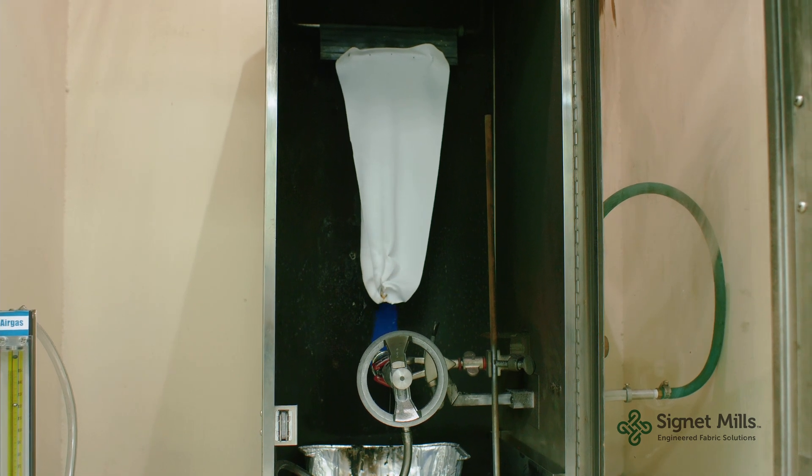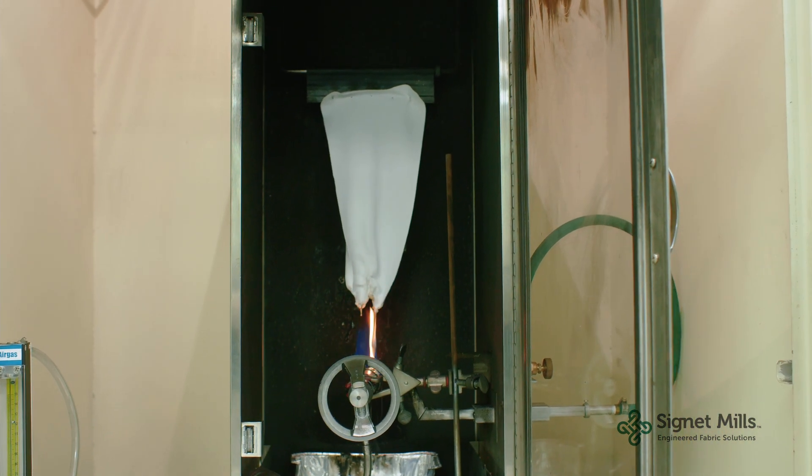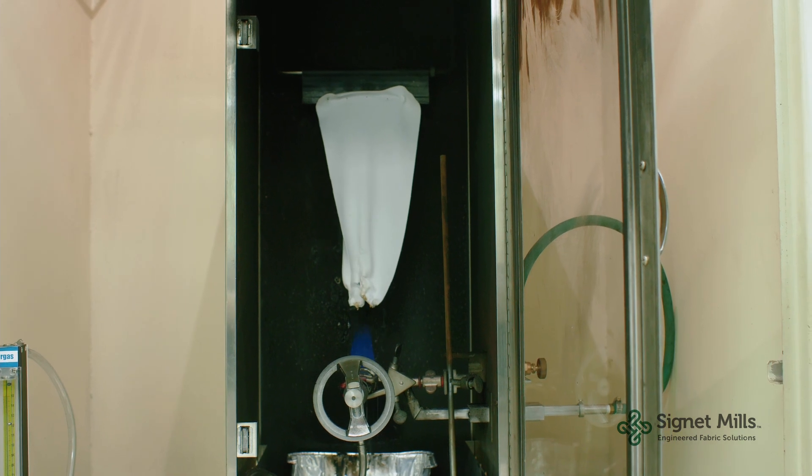So the flame will continue to burn for 45 seconds before being turned off. And you can see the drips going to the bottom.